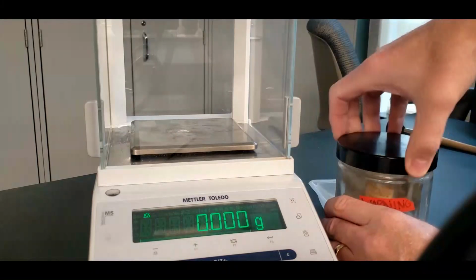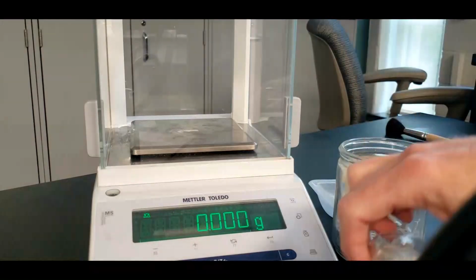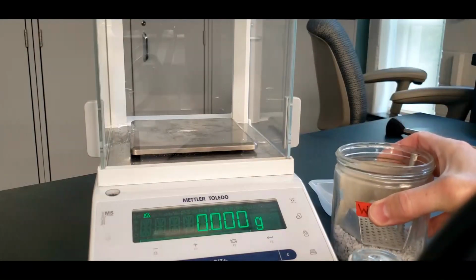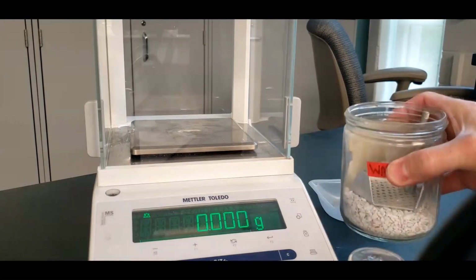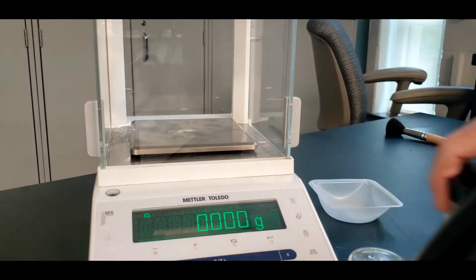So we take off the top here. All kinds of desiccators. This is a pretty small one. Here is a sample of KHP. And then inside here you see the Drierite, those pellets. That's anhydrous calcium sulfate. Anhydrous means there's no water in it. This actually has quite a bit. It looks like it's older. But it's to keep the water out of there. So we don't need this guy.